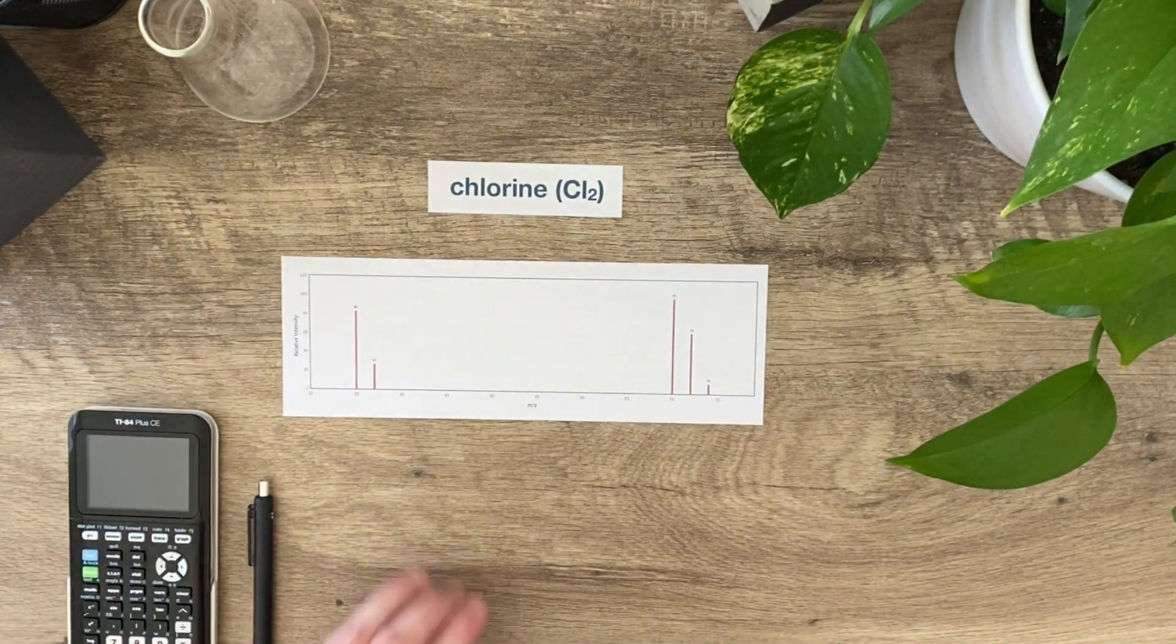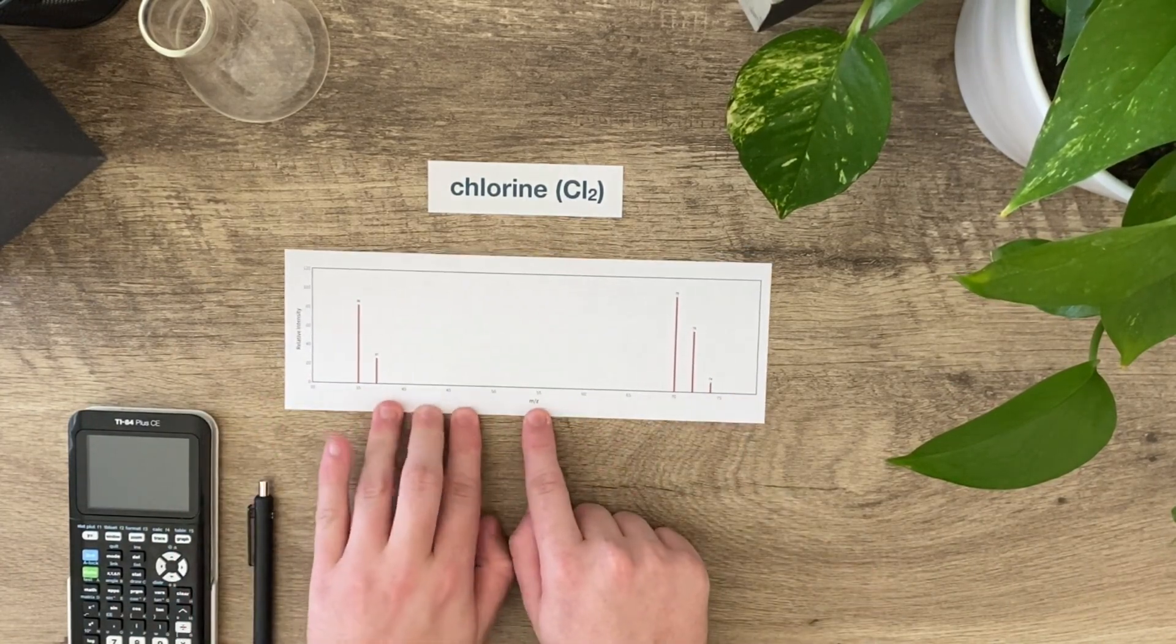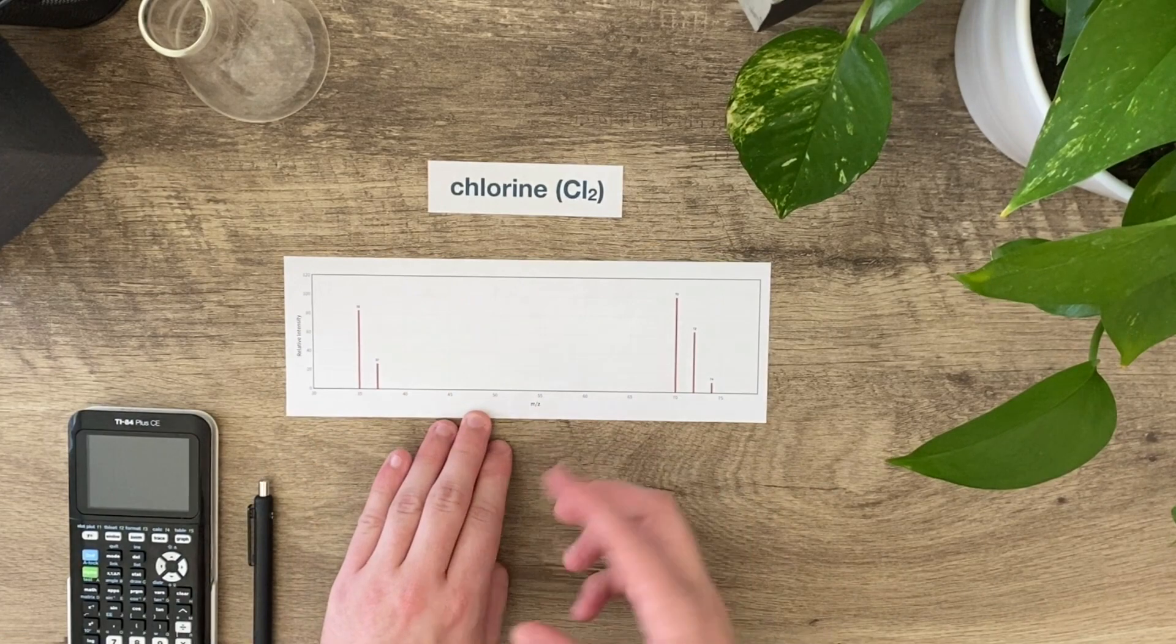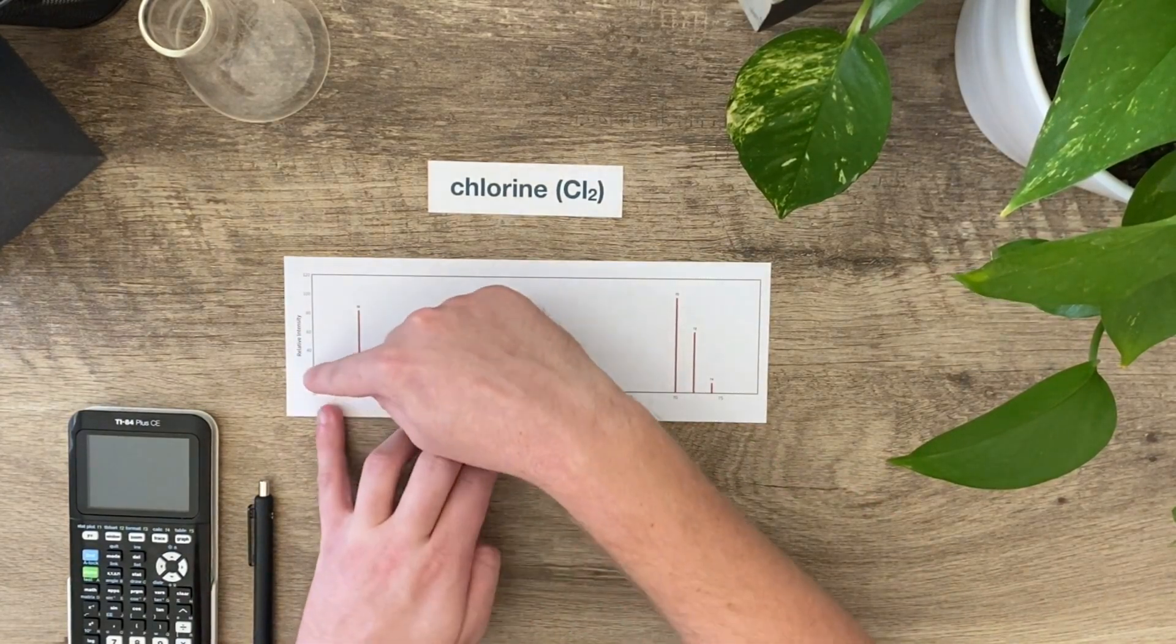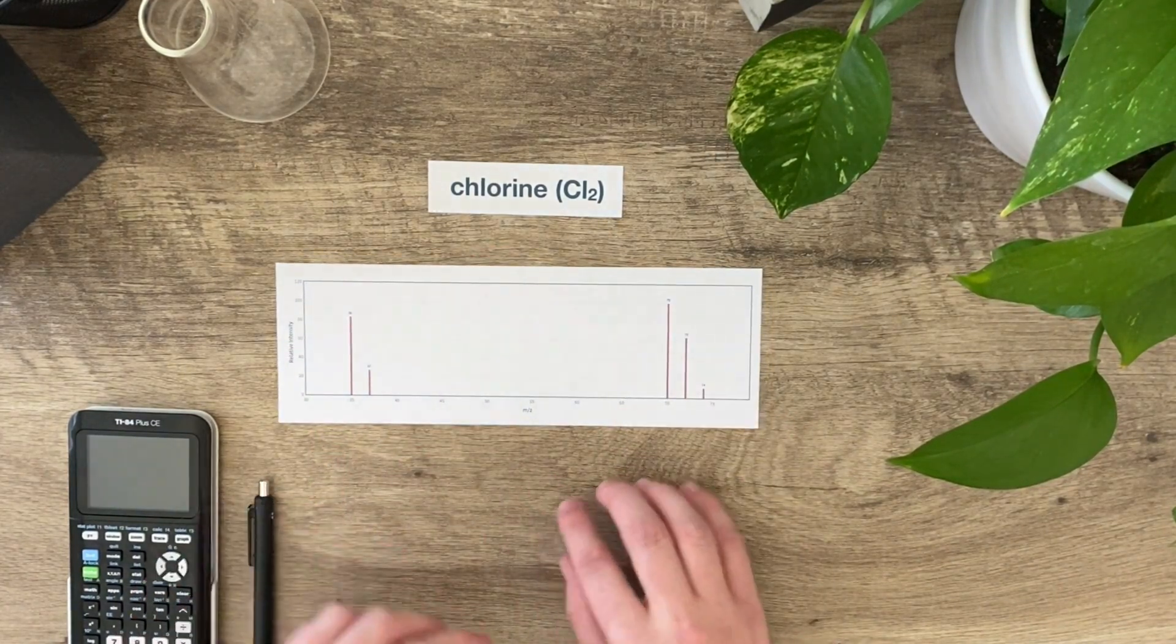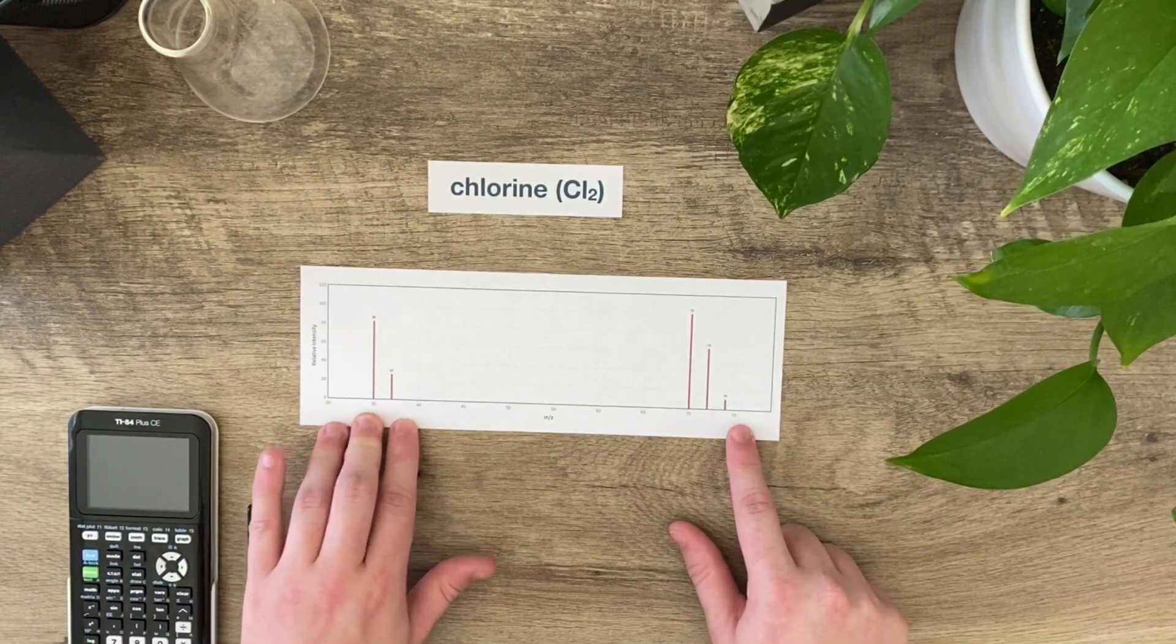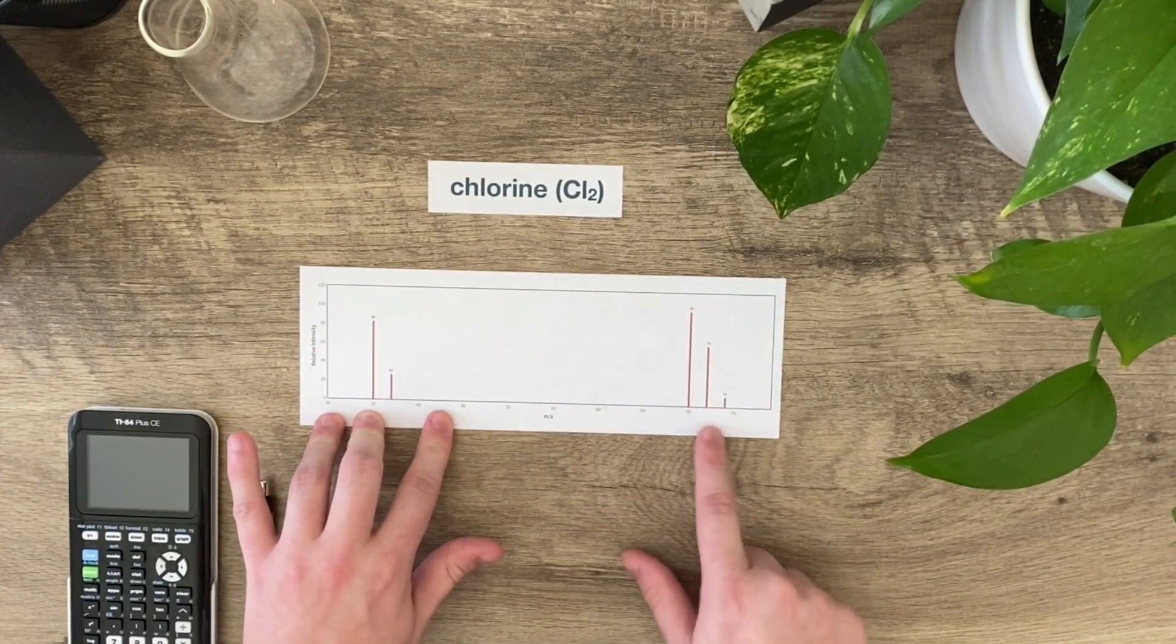If we look at the mass spec here, this is what the sensor outputs. You can see on the bottom on my x-axis is an m/z ratio. The m/z is mass to charge ratio, which you can kind of think of as the mass of whatever the substance or molecule might be. On the y-axis I have relative intensity, and you can think about intensity as abundance, so how frequent does it happen or occur. On this mass spec I can see there are five peaks: one at 35, 37, 70, 72, and 74.